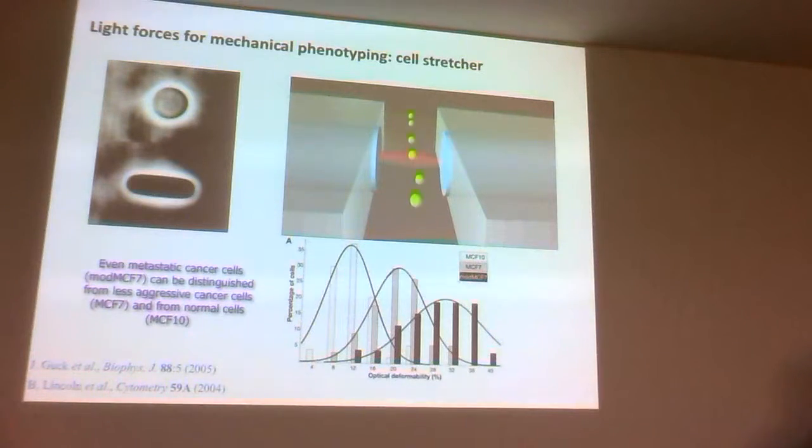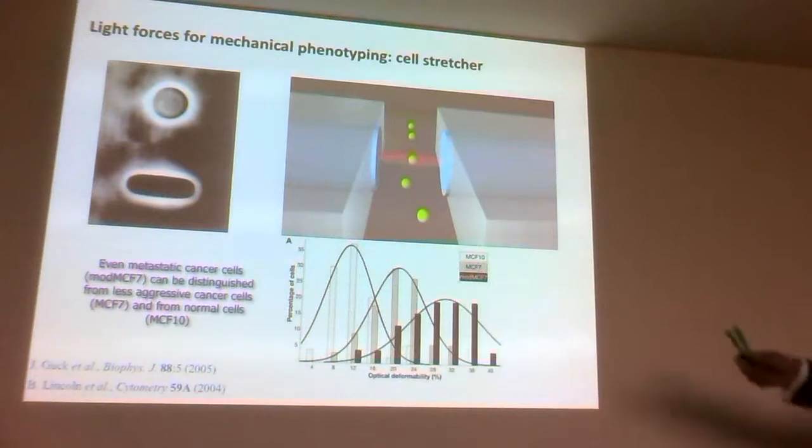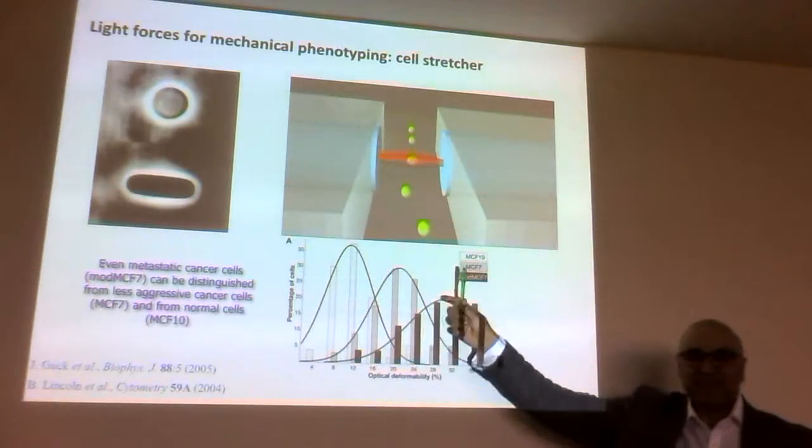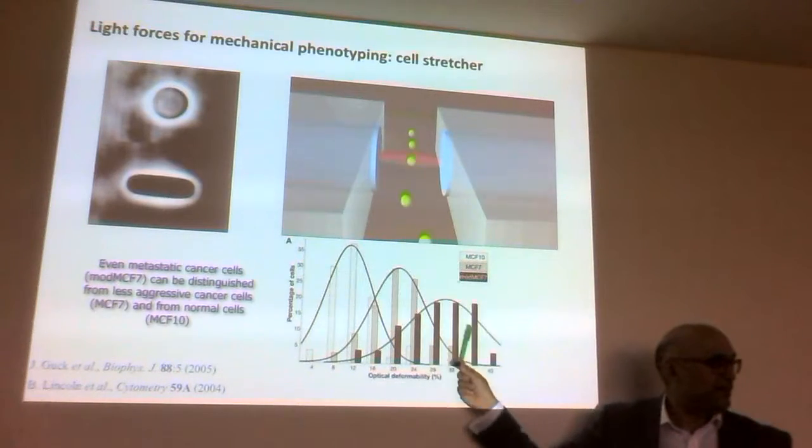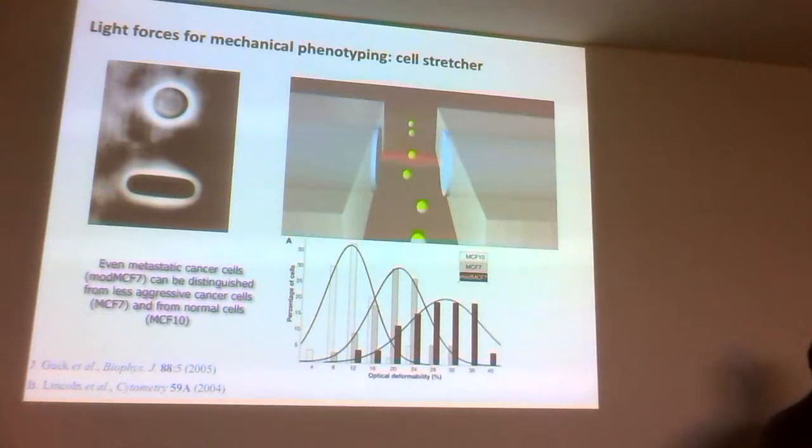Now this isn't the only test you do, but what they found was that deformability, measured by taking pictures, meant they could say to a patient, for example, if you've got too many cells in this part, you go and do another test. So that's the kind of idea. They're using it at the moment for oral carcinoma, which is a very difficult thing to test for, and a few other things. And they're also parallelizing the flow.